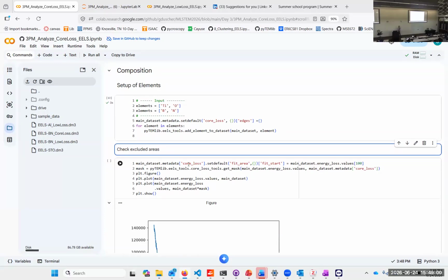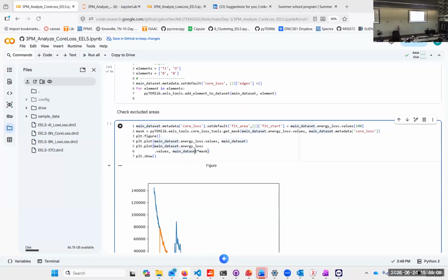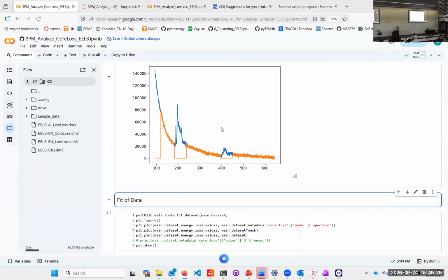So what we did now is we created the cross section for boron and nitrogen, and where these edges sit, and what I consider the near edge structure, the parts that I don't know, the solid state effects, the band structure stuff, right? We only have the behavior from the cross section, so the scattering probability for the single atom.